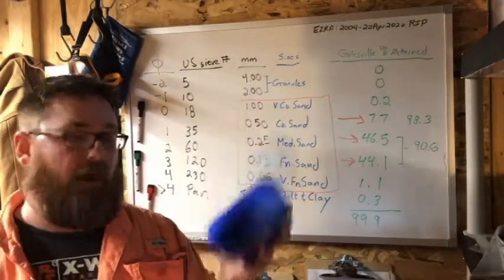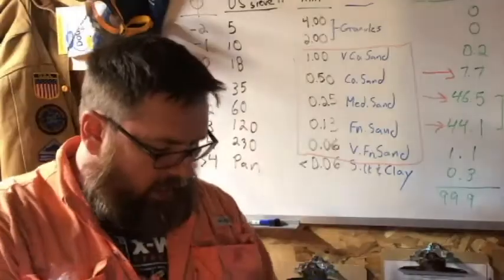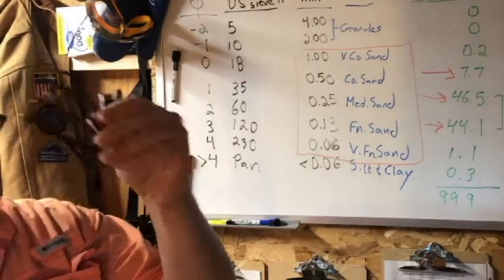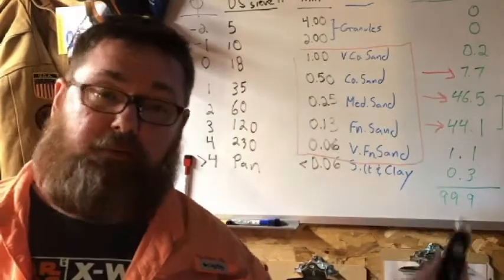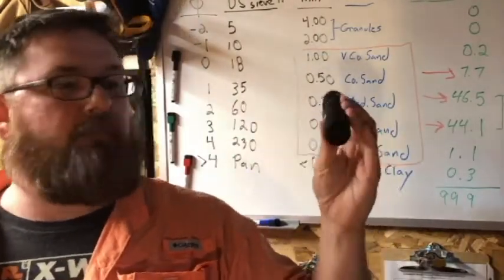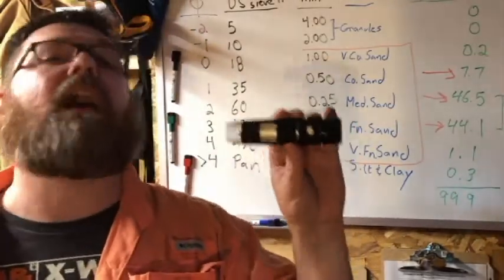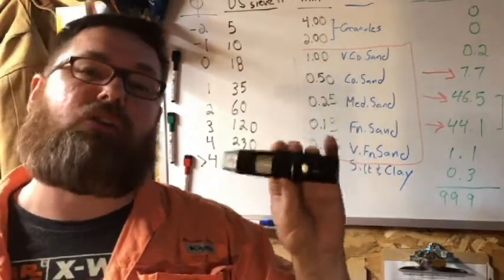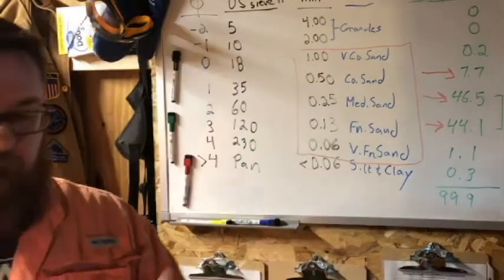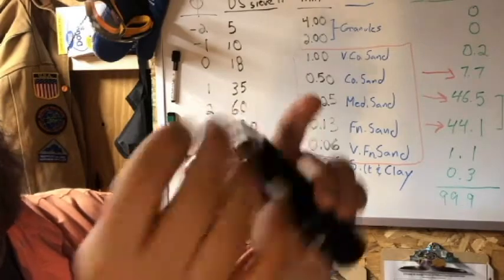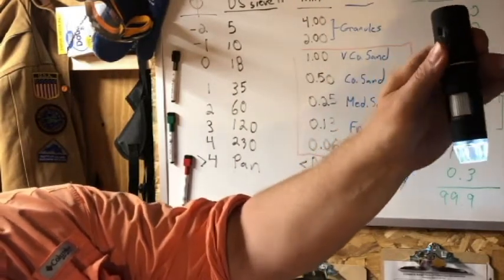This is our microscope. It's a relatively recent purchase. It comes with a stand. This is the charger—you plug this in any USB to charge it. This is not terribly expensive. This one was $50, a little more than the cheapest ones which run about $20, but those are usually only compatible with Android. This is compatible with my iPhone, Android phone, PC, Mac, anything. You have to download an app to use this to get what you're seeing.